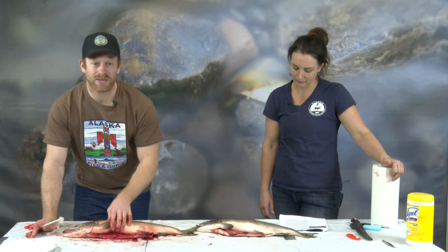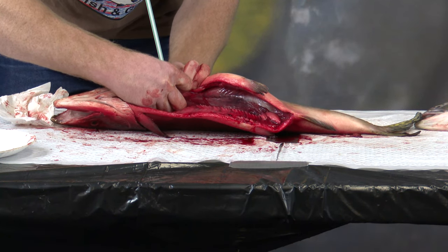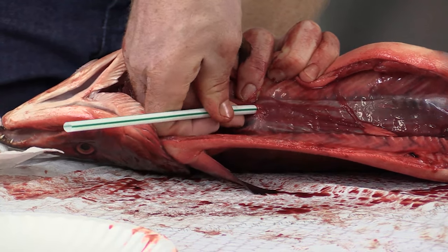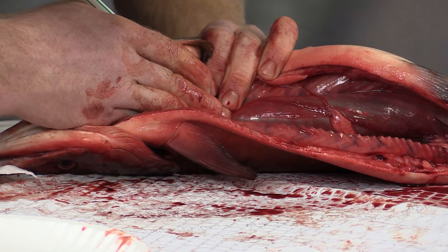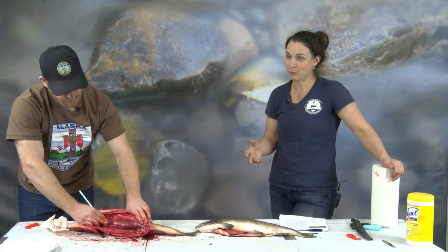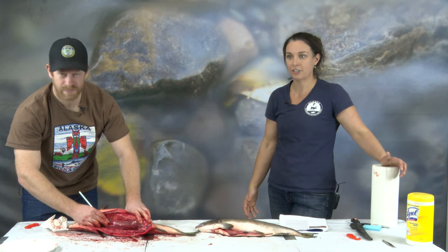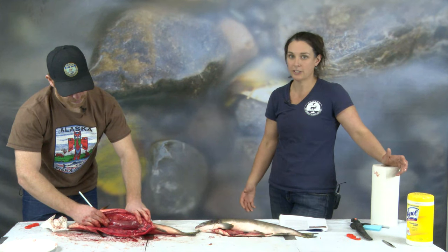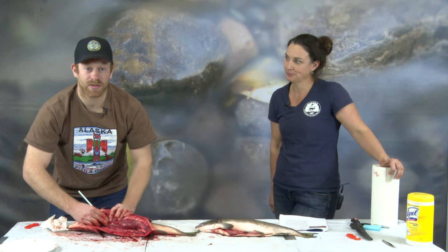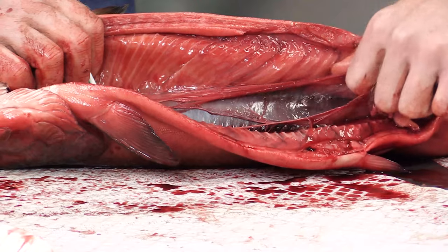Now that we've removed all the other internal organs, we're going to look at the swim bladder. Take a straw and poke it into the upper end of the swim bladder, get it between the two layers, and blow in the straw. Now you can see how it's used — fish use the swim bladder to control their buoyancy. Salmon can essentially burp air; this is called a physostomus swim bladder. Other species like rockfish have a closed or physoclistic swim bladder, meaning they are not able to burp the air. To remove the swim bladder, gently put your pointer finger underneath it and slowly rip backward — sometimes it doesn't all come out in one piece.